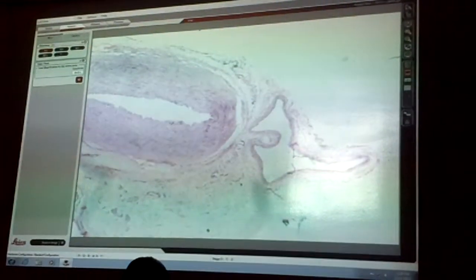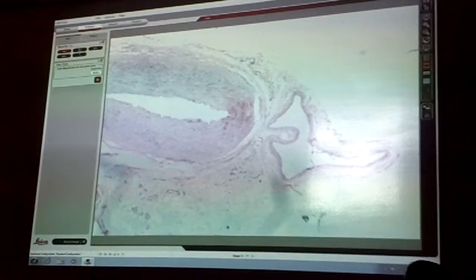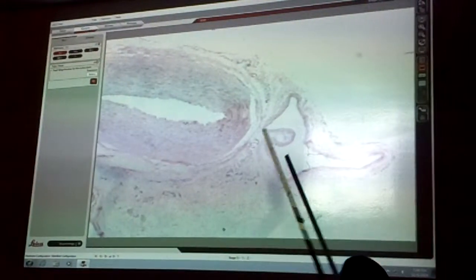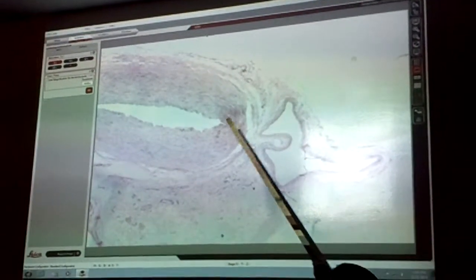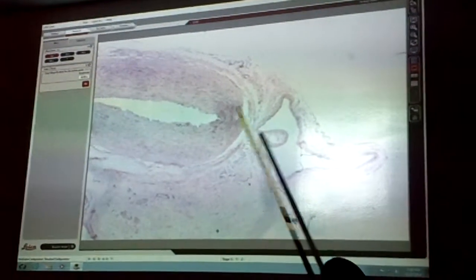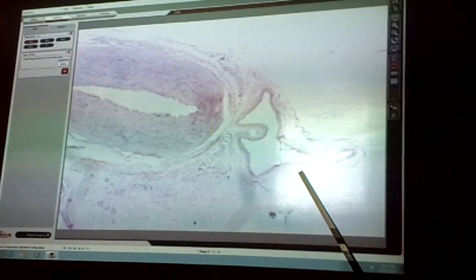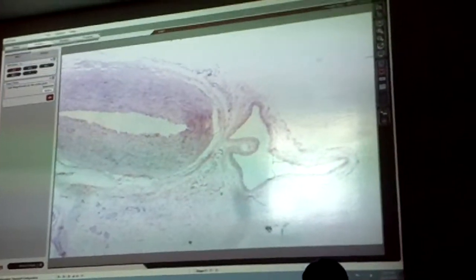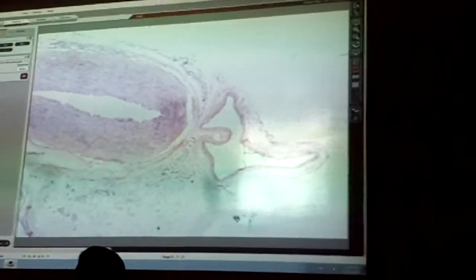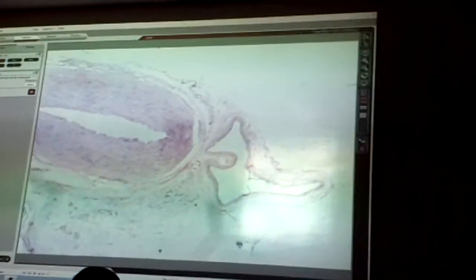I was guessing that big one was the artery, and that little one in the corner was a vein. Okay. Layer. Tunica media. Externa. Tunica externa. This is the vein. This one is the artery. Any questions on that? On the exam, are they going to have them both in the field of vision to compare? Hopefully. Yeah, for comparison purposes, yeah.